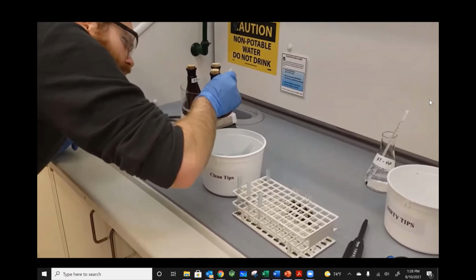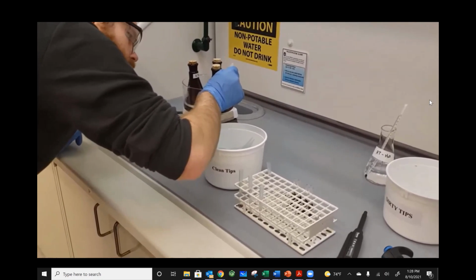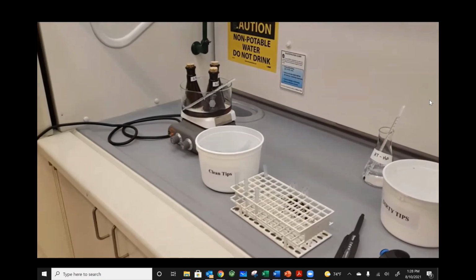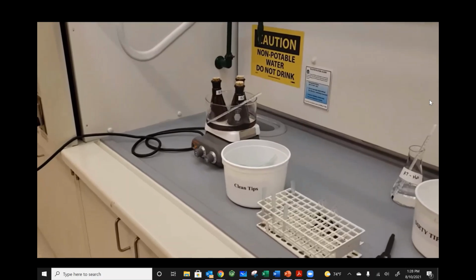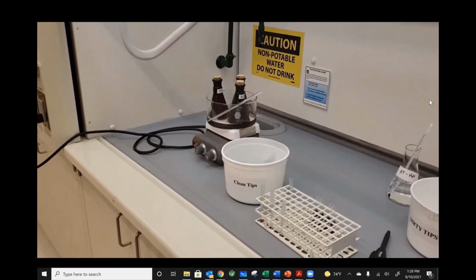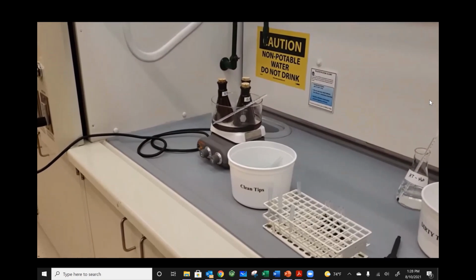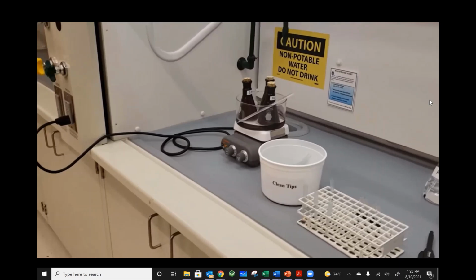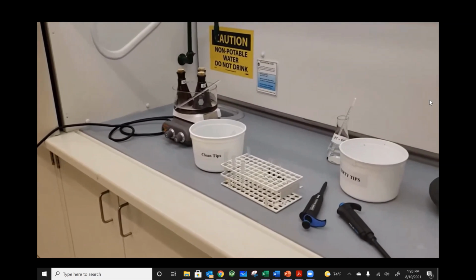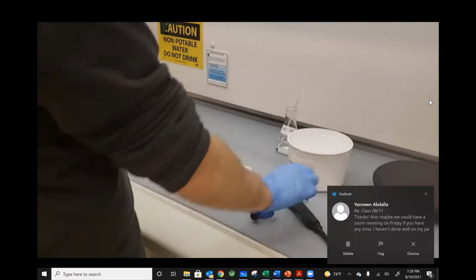It's going up. Call it an even 45.0 degrees Celsius. So I'll write that down. 1-4, temperature is 45.0 degrees. You should never bring your work stuff into the fume hood. It is only for chemicals and the instruments that you are working with.